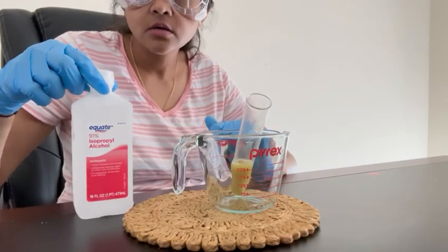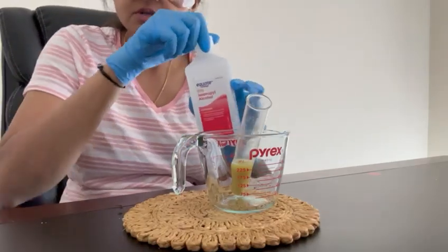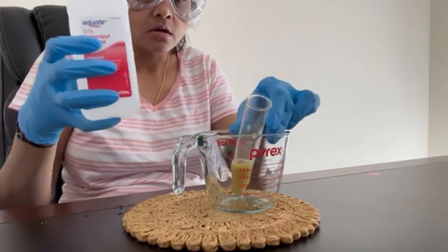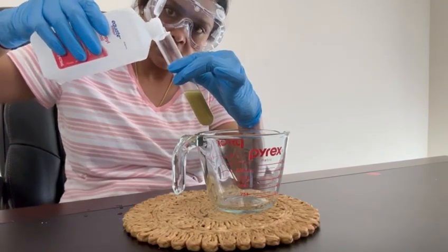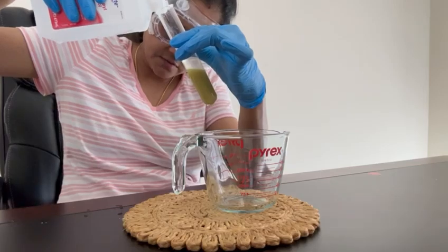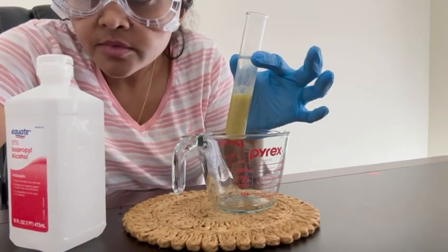All right. Now I have taken out this 91% isopropyl alcohol from the freezer, and I'm going to add about an equal amount to the test tube, holding the test tube at about 45 degrees and pouring slowly. As you can see, there is a separation into two layers. All right, I'm going to let the solution sit for about 1 minute.